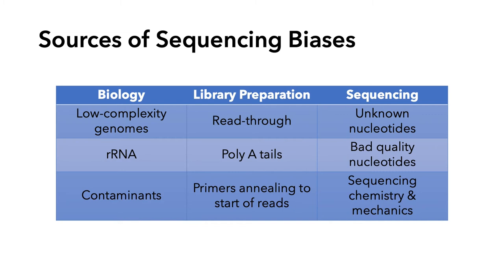Sequencing-related sources of bias include unknown nucleotides, where the sequencer can't call a base, bad quality nucleotides where there's low confidence in base calls, and sequencing chemistry and mechanics. For example, it's totally normal for read one to have higher average quality scores than read two, because sometimes the second read pairs will sit too long before the second pass-through on the sequencer. These sequencing biases are almost entirely out of your control — there are ways to address them, but not much you can do to prevent them.